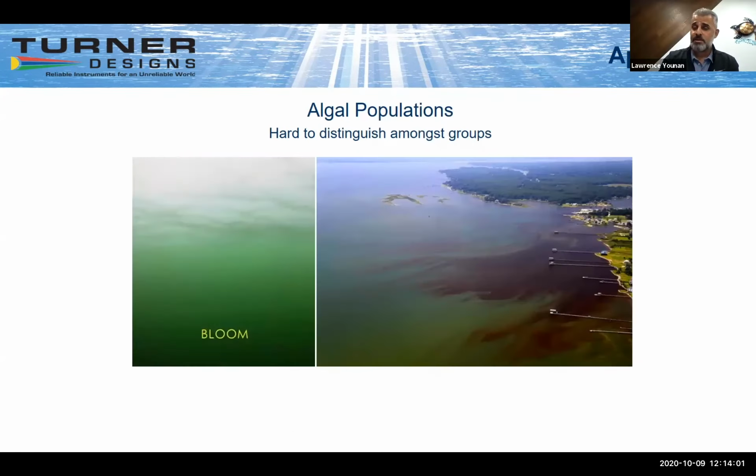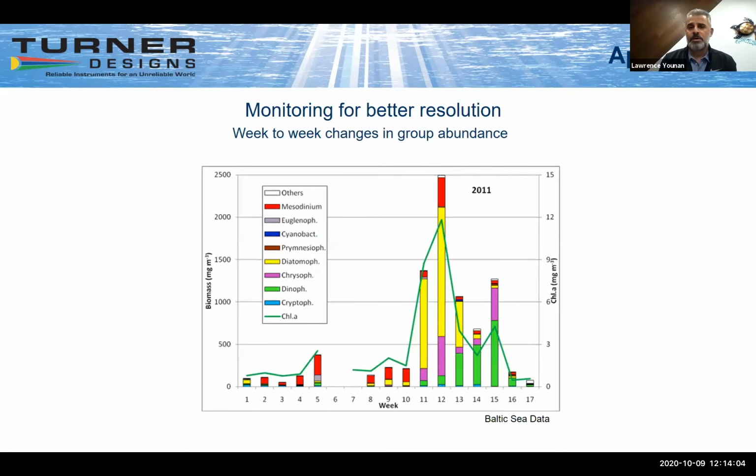I mean, they exist anywhere there's water. So it's tough to get at those and get good resolution for your data set using a handheld device. So what we are trying to do is go into the water. And that's the push these days that we see from people, is they're trying to go into the water versus take water out of the environment as they used to do in the old days and take it back to the lab. There are all kinds of problems with doing that kind of processing.